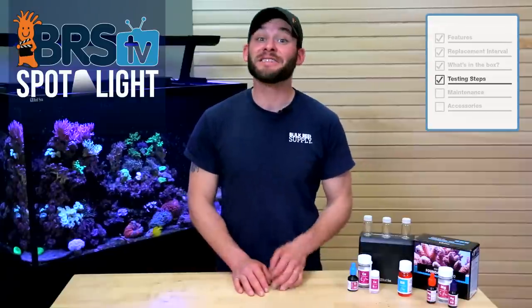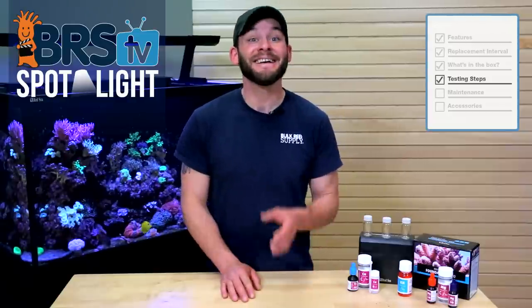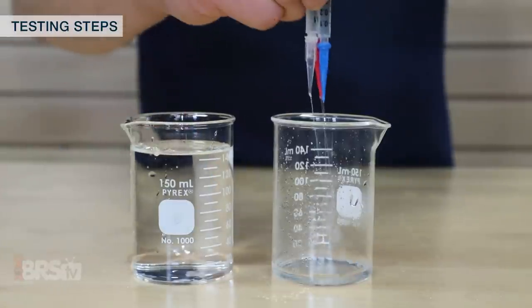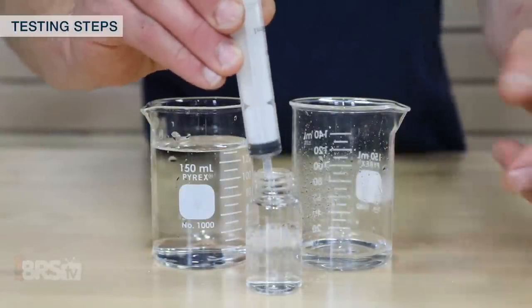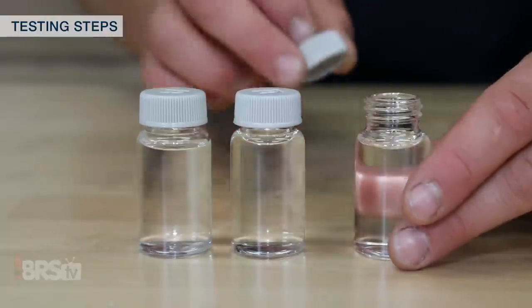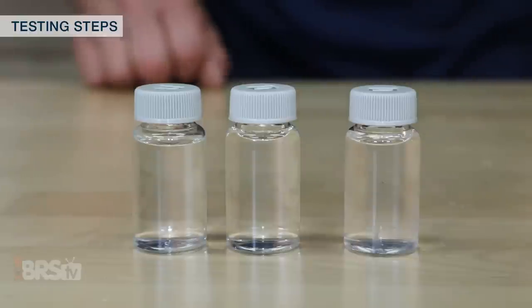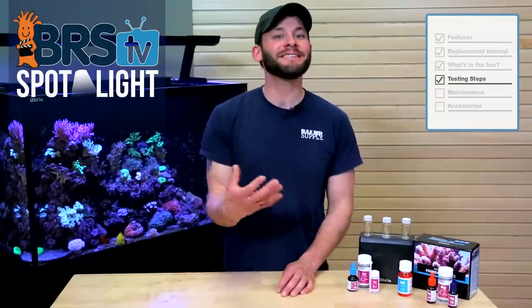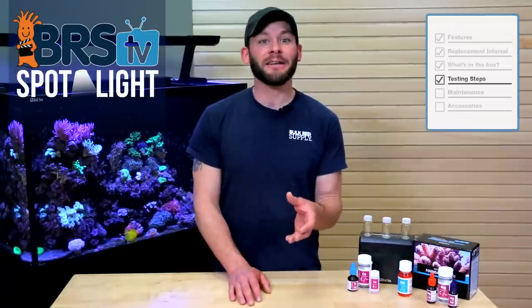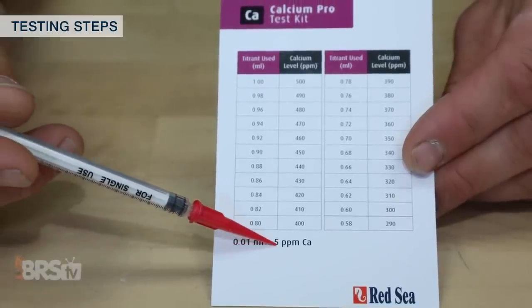That's really all there is to it, and it's pretty simple, but here are a few additional tips to help you continually achieve consistent results test after test. Rinsing the vials and syringes with RODI water after each test helps keep them clean from old reagent, which if left unrinsed could skew future tests. It's also best practice to store each vial filled with RODI water so they're clean and ready for the next test, saving time in future testing prep. If your sample doesn't change color and you've used an entire syringe, you can continue the test by filling another syringe of titration solution and keep adding until the sample changes, then easily calculate the endpoint using the conversions on the bottom of the testing cards.